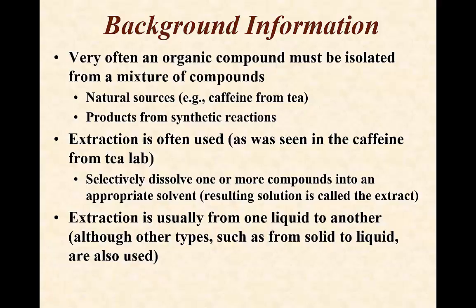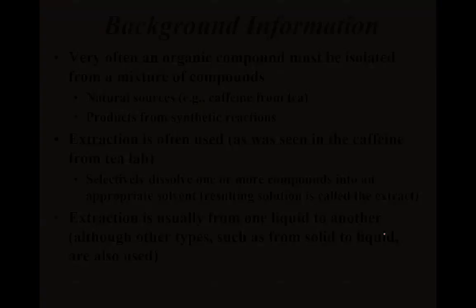solvent. Now, extraction is usually from one liquid to another, although you can have many types of extraction. You can have extraction from a solid to a liquid, you can have solid to gas phase. There's a lot of different ways to extract things.